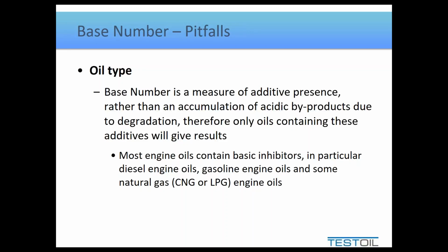It's very common for some labs to do base number by FTIR because it is much faster than doing it by titration. But again, not all oils have a base number, so that's why it tends to be restricted to engine oils only. So if you rephrase your question, can you replace acid number with acid number by FTIR? Certainly. Replacing with base number, only if it has the right additive chemistry.